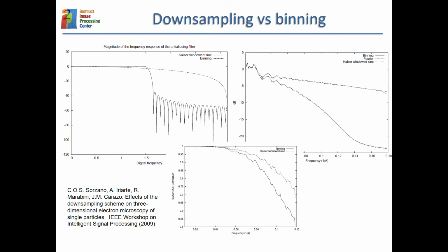There is another idea related to micrographs, that is the use of smaller micrographs. These micrographs sometimes can be really, really large, like 8K, with a very, very fine sampling rate or pixel size. For instance, let's say that your pixel size is 0.5 angstrom per pixel. So you know that Nyquist there is 1 angstrom, and you know that your structure will not reach 1 angstrom resolution.